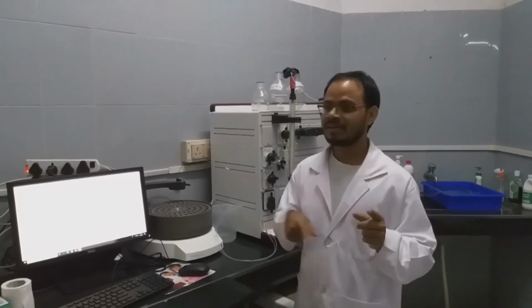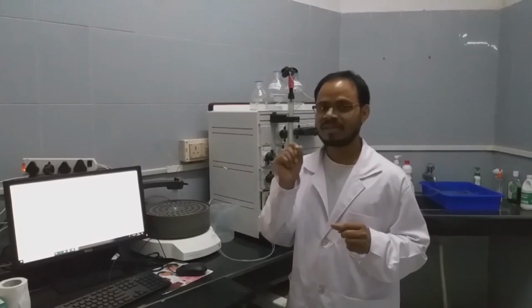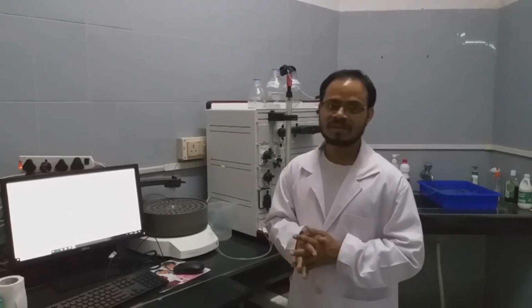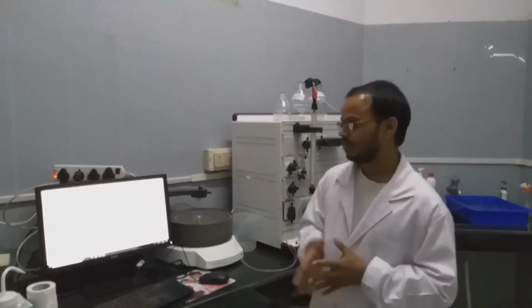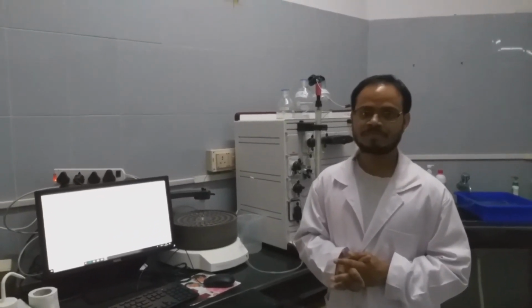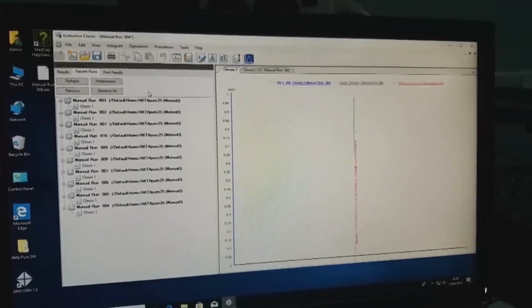You will get a straight line graph, and based on that line you can get an unknown protein's molecular weight. That can be discussed in the size exclusion chromatography video. Now we will show you how to analyze the results.